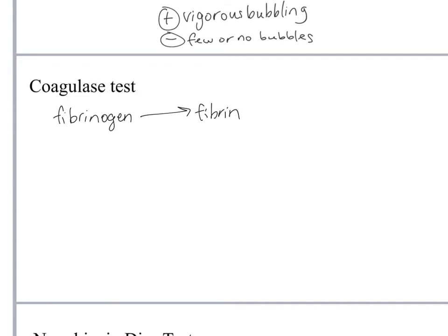Coagulase reacts with prothrombin in the blood, which results in staphylothrombin, which enables the enzyme protease to convert fibrinogen to fibrin. Okay, the result here, what we're interested in, is that it forms a clot in the plasma or in the blood. Okay, this is actually an exoenzyme. And we skipped our whole lab on extracellular or exoenzymes, but that just means it's an enzyme that bacteria secrete outside of their cell. Okay, so it does all its work outside of the cell.